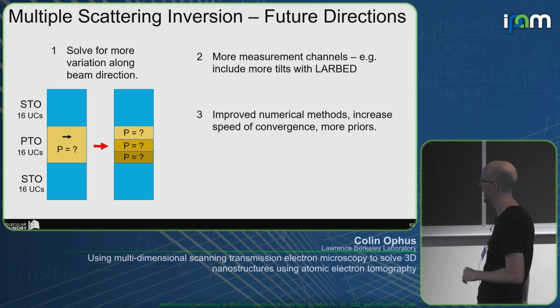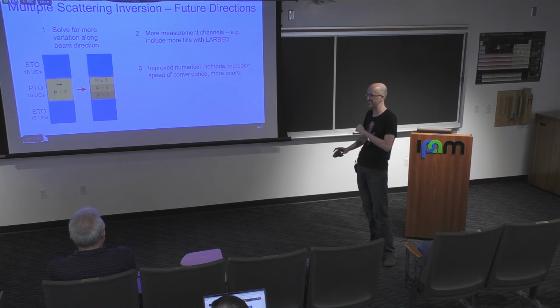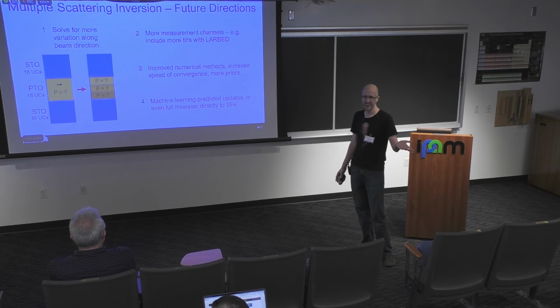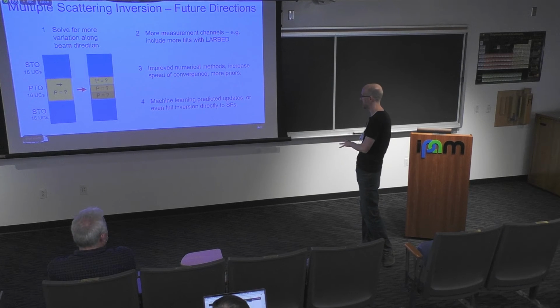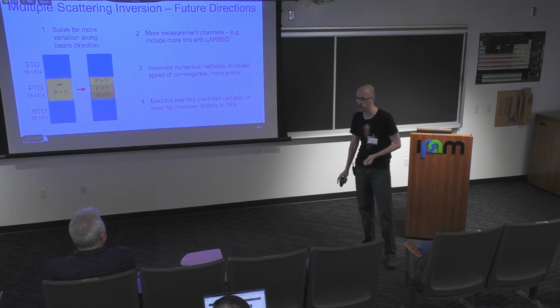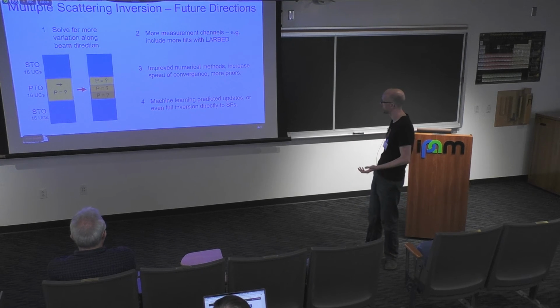I'm not a mathematician. I just use whatever crumbs mathematicians are willing to donate. And then, of course, machine learning. So many of these problems that classic image processing algorithms can't handle, or classic mathematical algorithms can't handle, machine learning is just much more efficient at encoding prior knowledge than any previous sort of method.